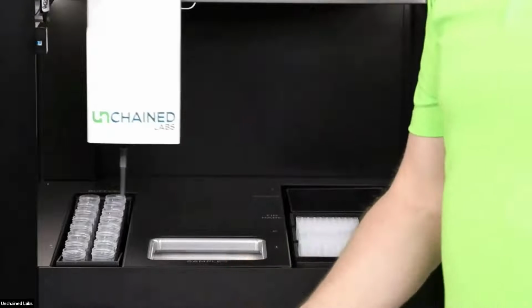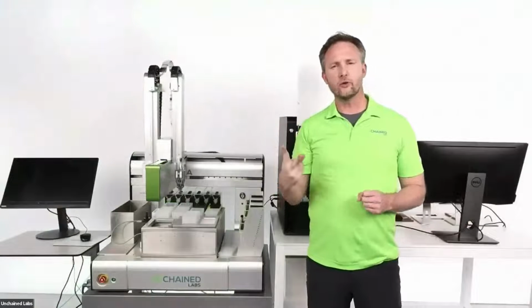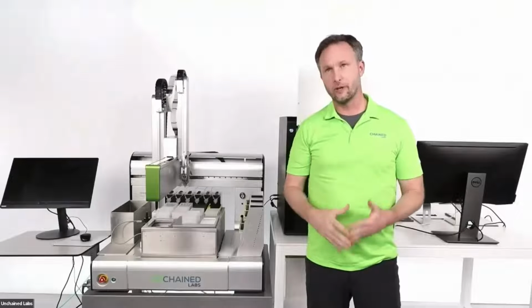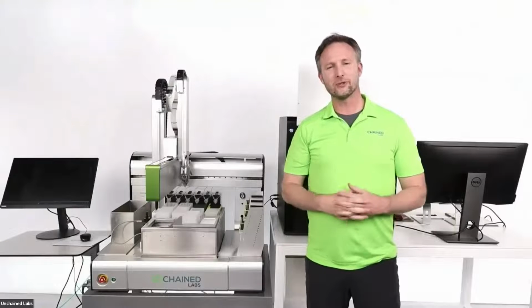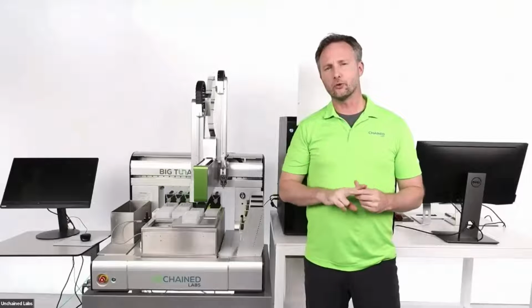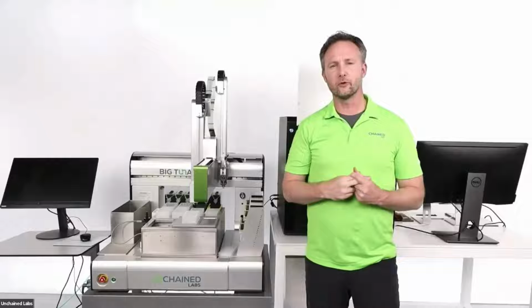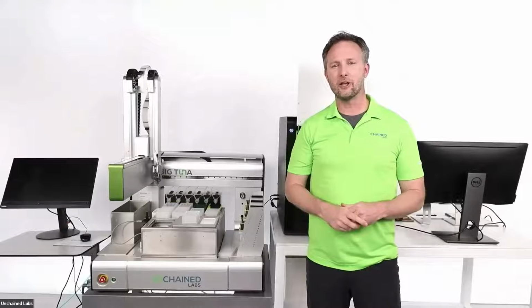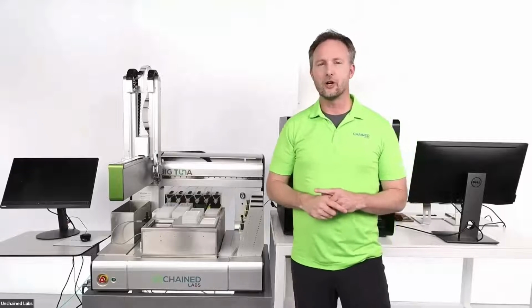And so with that, hopefully you have a nice idea that you have 2 options, not 1, but 2 options to take advantage of our adaptive positive pressure ultrafiltration diafiltration technology so that you can save not just time, but also achieve superior sample recovery results. So thank you very much for your patience and for your attention. And with that, I'll turn it over to my colleague, Dr. Ross.